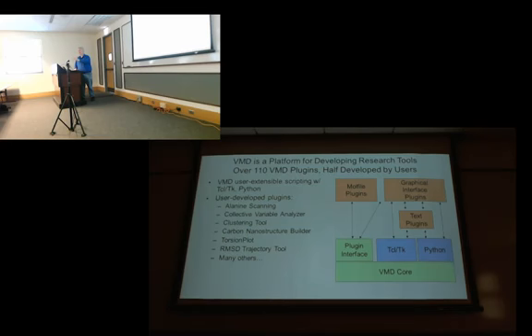You can just write new procedures and scripts, and you'll learn a little bit about that in the VMD tutorial if you work all the way through it. And so that'll be a good introduction to the ideas behind it, but of course you can go much further.